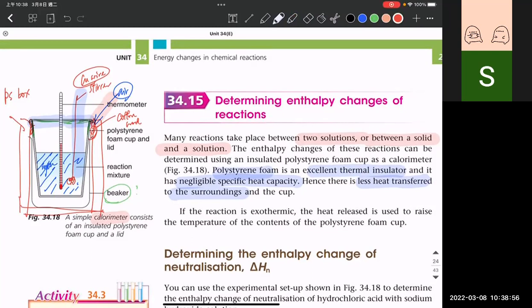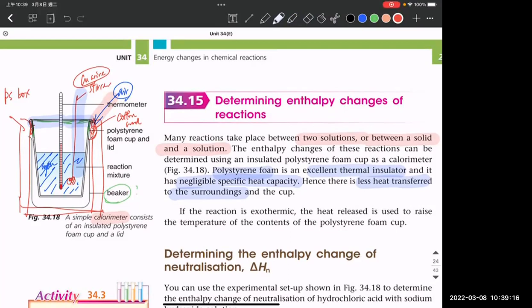So that's why, if you allow a flow of air, we would produce convection more easily. So it is also a mode of heat transfer. For those who study physics, you should understand what I mean, right? For those who did not study physics, don't worry, it's something about common sense. So whatever design you have, the ultimate goal is very simple: to reduce the heat loss to the surroundings. Can you get my point?